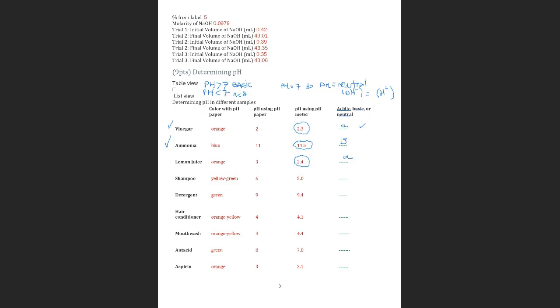So you continue completing this. This should be easy, and it will give you an idea of the shampoo that we use every day or the detergent, if we are using acidic or neutral, and you can complete based on just this, to complete this part of the experiment.